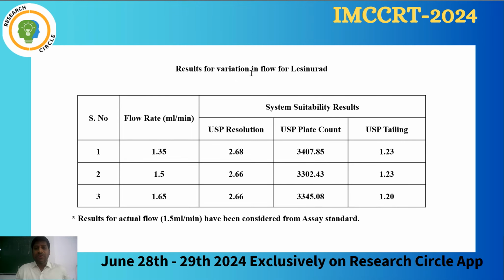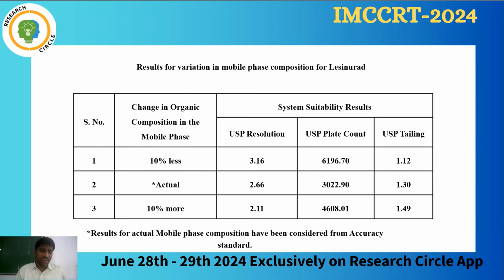Like that, we have to go for the Lesinurad variation in flow also. These are the results obtained. Whatever the plate count, resolution, and tailing factor, they were within the acceptance criteria as per ICH guidelines.